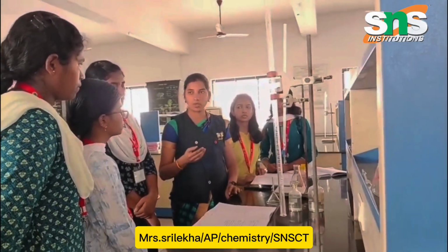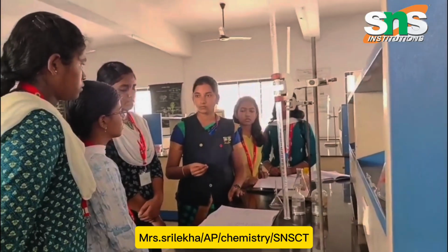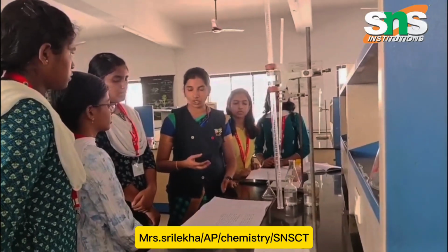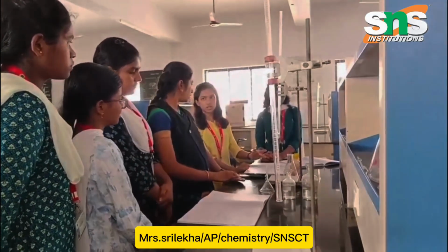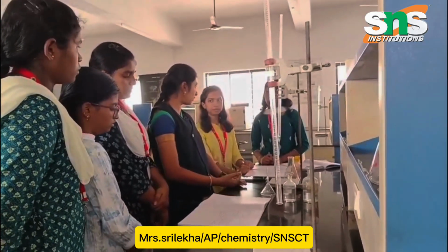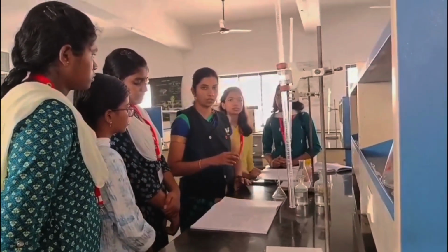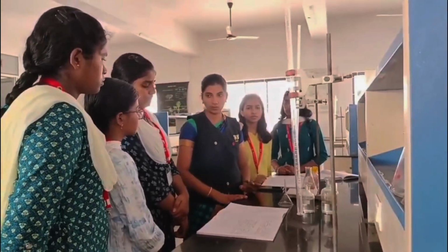From this experiment, what have you learned about these water samples? The disappearance of the phenolphthalein color, and from the first titration to the second titration, the color changes. It is the same solution, but the color variation is different. So this is the experiment to determine the alkalinity of water samples. Thank you.